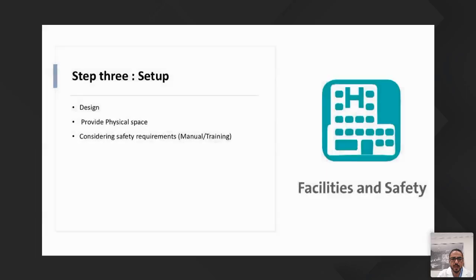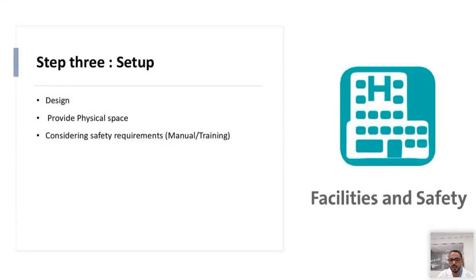The next step would be to consider the setup of that new area within the lab. You have a good space. I mean, no one would come straight out and say they have enough space within their laboratory. However, if you manage to secure some space within your lab, then you would need to consider the design, you need to provide the space, and you consider the safety requirements when it comes to the setup of the laboratory. What safety requirements are there, negative pressure, is it an isolation area, and so forth. So that is the setup when it comes to your facility and safety.